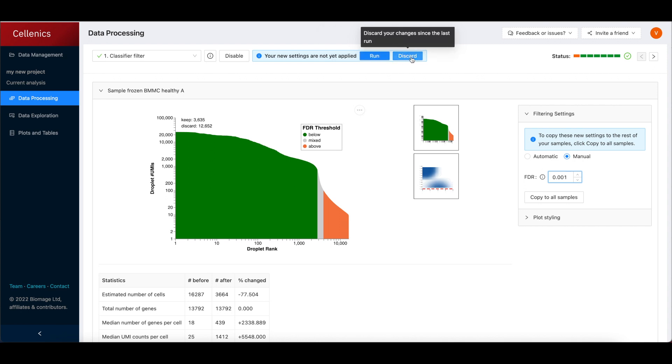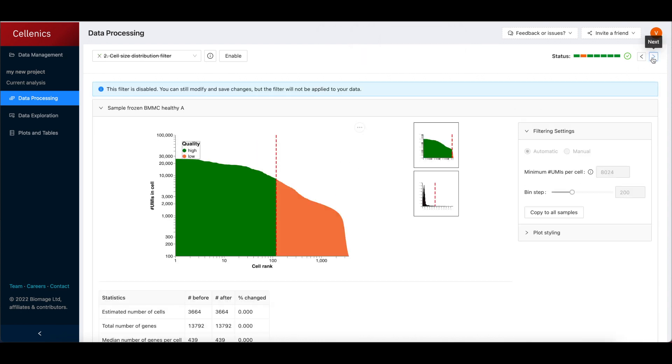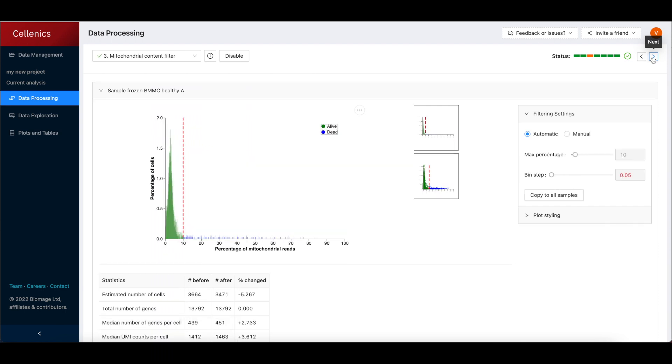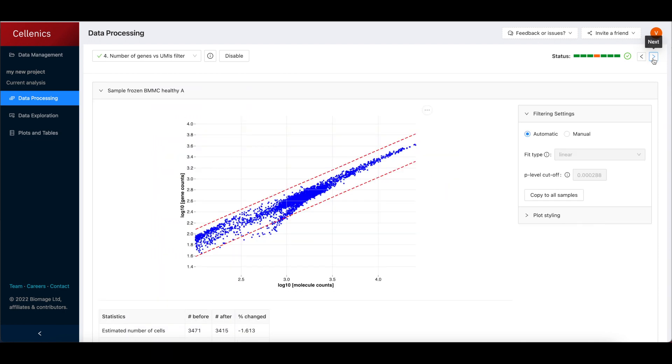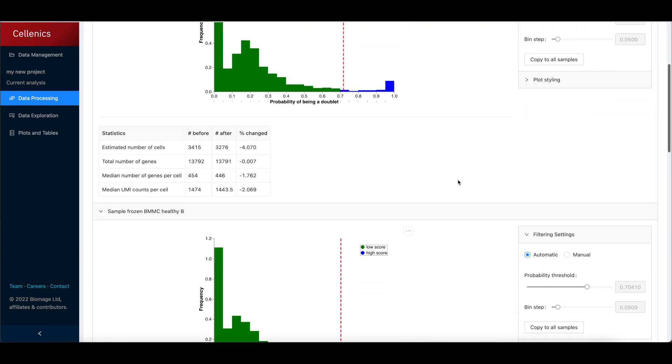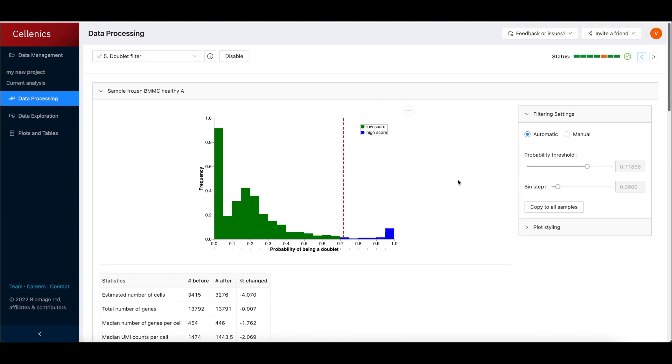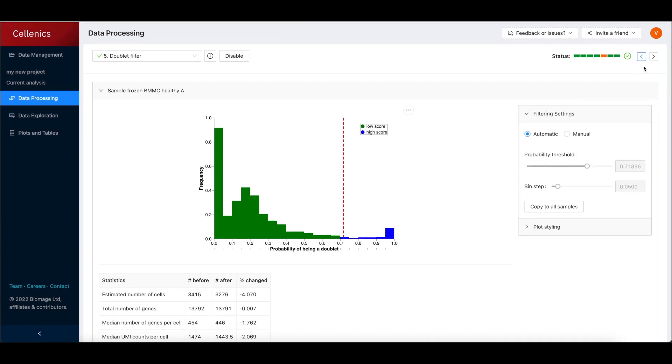The first five steps filter out empty droplets, outliers and poor quality cells, dead cells, and doublets from each sample. The QC plots and filtering statistics for each sample are listed vertically.